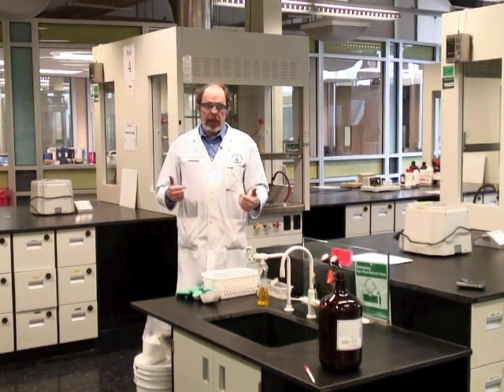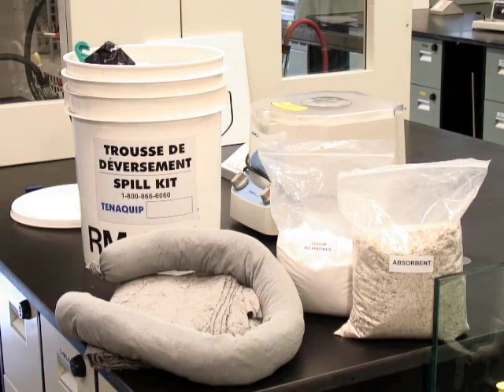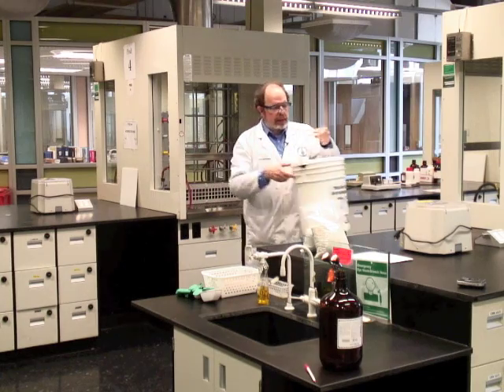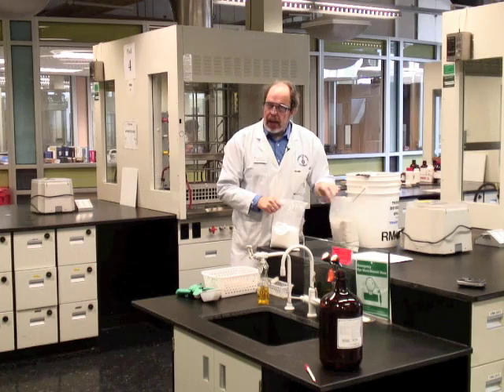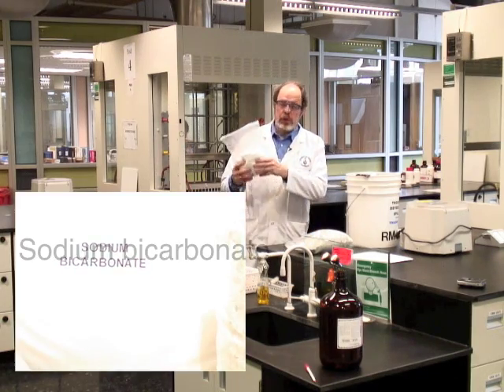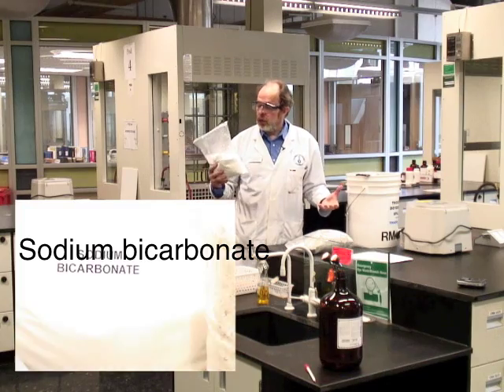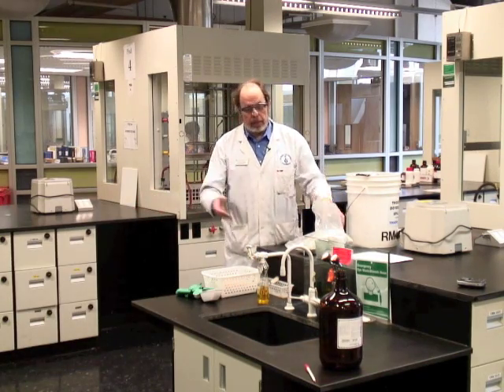There is a spill kit in the lab underneath the sink for just such an emergency. We've got bags of various things to neutralize it and the kit contains disposal mechanisms. If it is dilute acid or base, we use sodium bicarbonate which will neutralize the acid or the base, chemically react with it, and then we sweep up the mess.